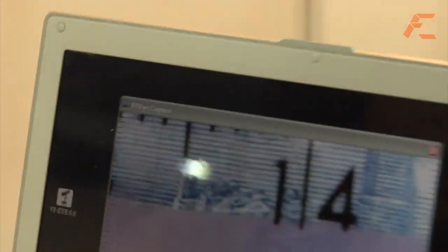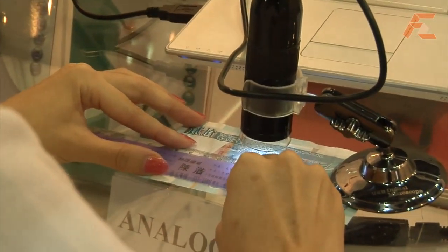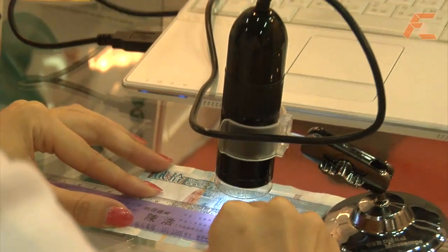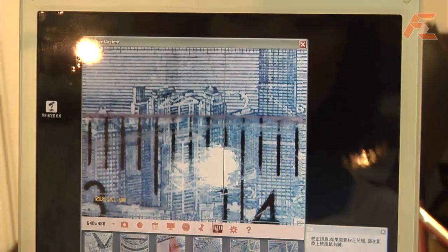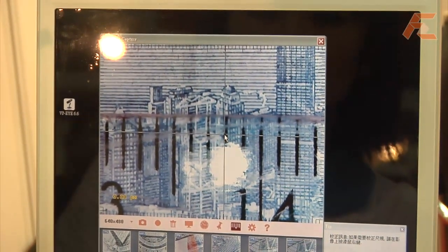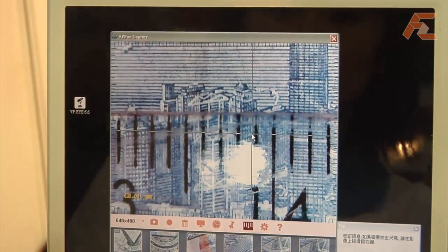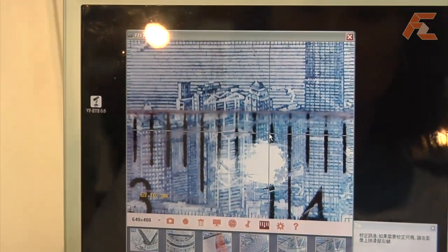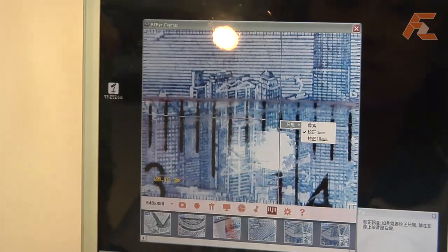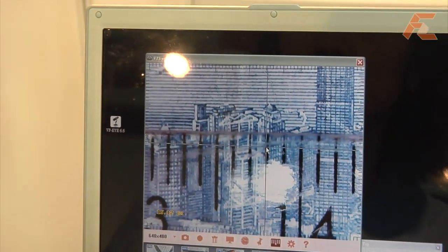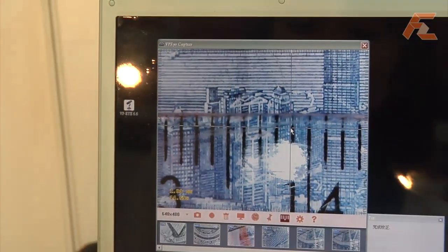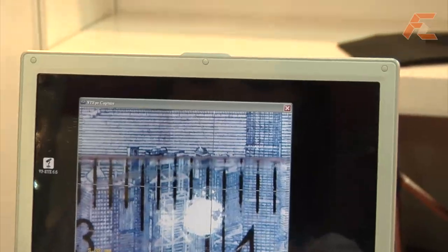First, we have to define one millimeter, like this. You're defining what the distance of one millimeter is, using a normal ruler under the picture. Like this — we define one millimeter.